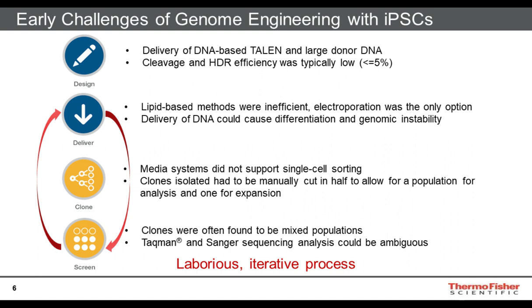So really, the pain in the whole genome editing process was, on the one hand, the delivery of the tools and the tool itself, but at the same time, the clonal isolation and screening had an equal problem in the whole workflow, which made it a laborious and iterative process where you had to go back several times to get to a success.